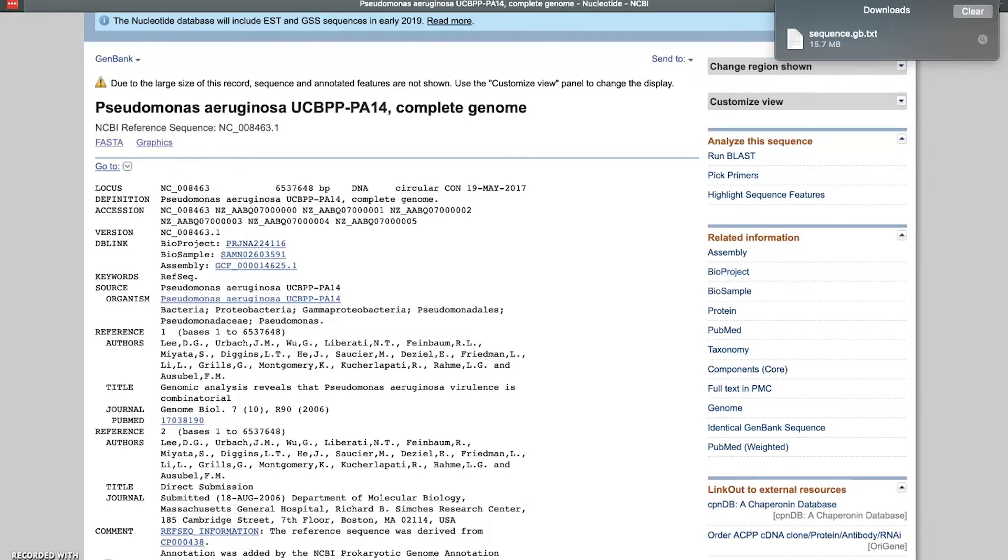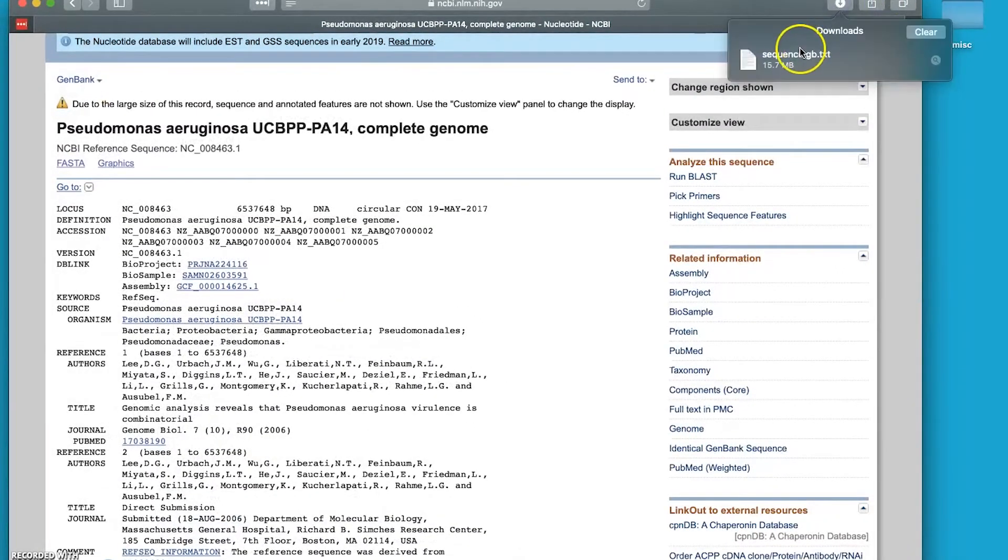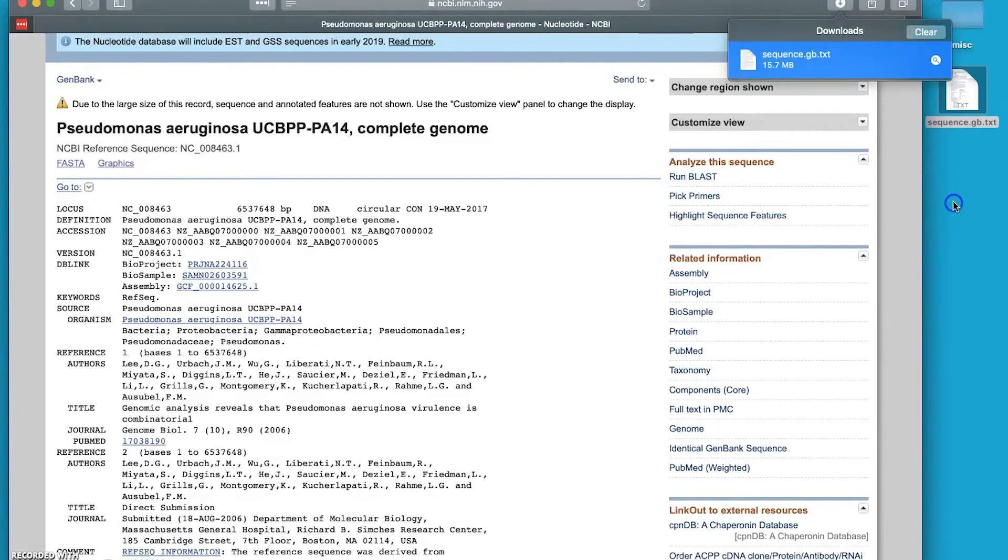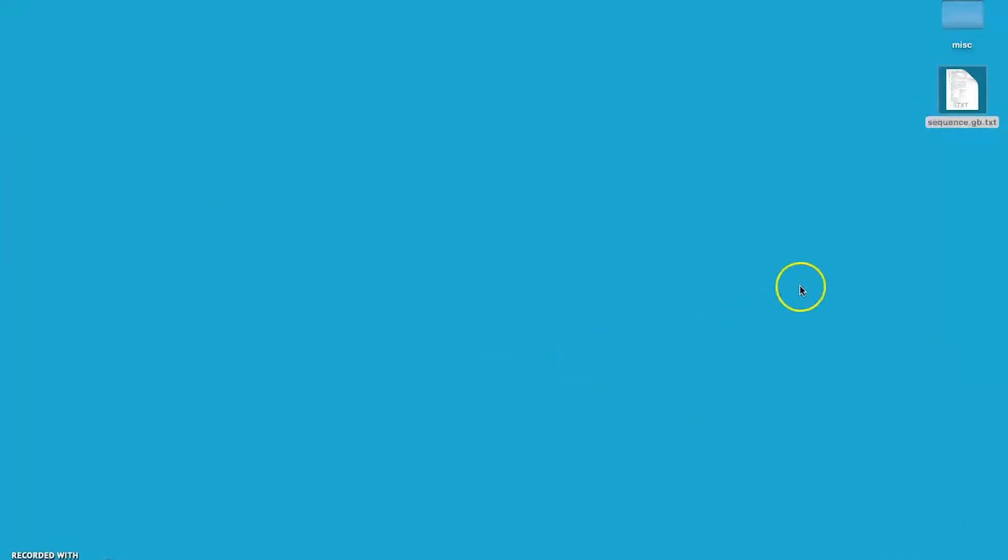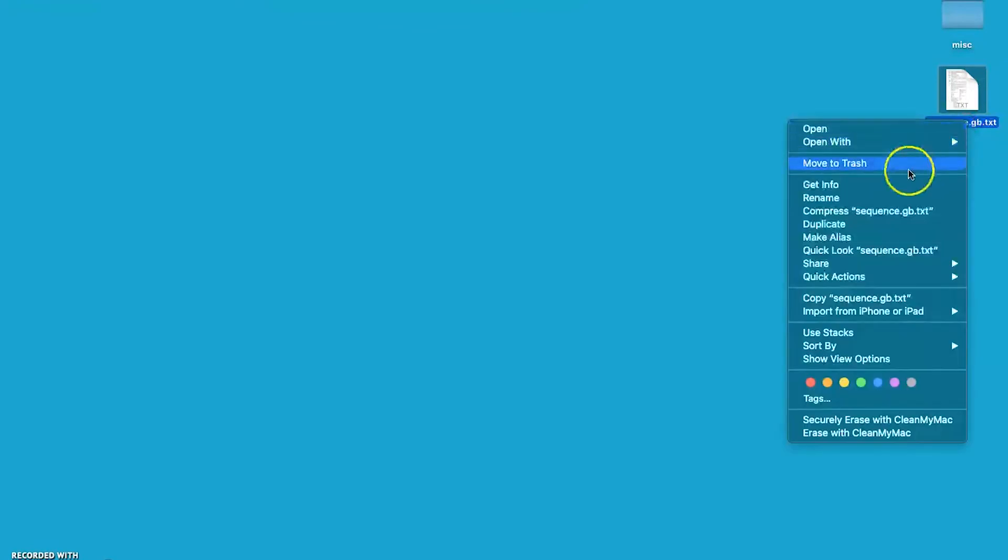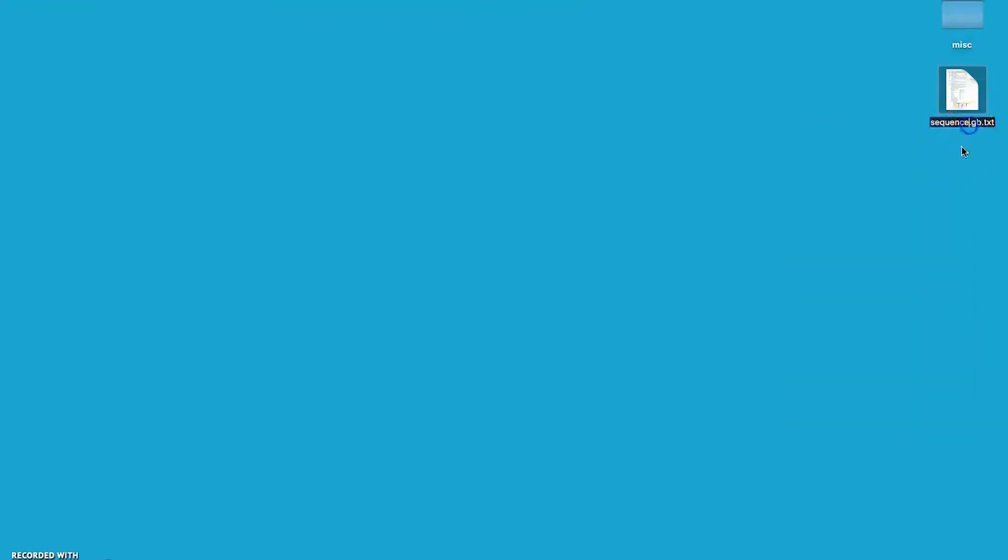So what we want to do now - I'm going to have to minimize this a little bit here - we want to, in this case on the Mac anyway, drag and drop this onto the desktop. Clear this out, minimize our browser. Now one thing we need to do here, or at least we want to do, is rename this file. What we normally do to make this easier is rename it to Pseudomonas_aeruginosa_UCBPP-PA14. We want to get rid of the file suffix .text and we want to call this .gbk, which means it's a GenBank file format file.